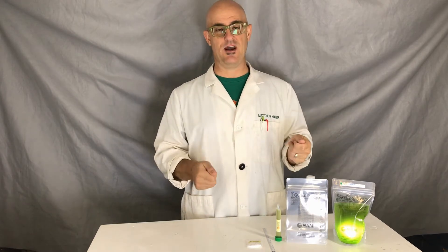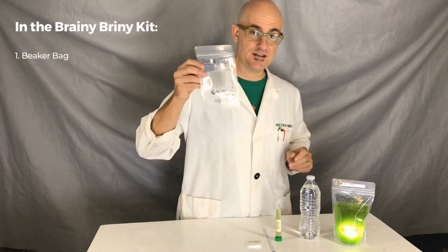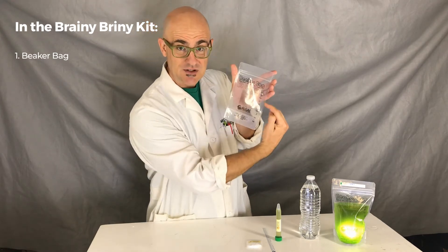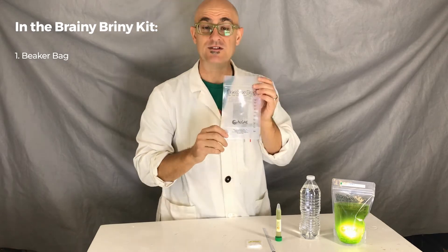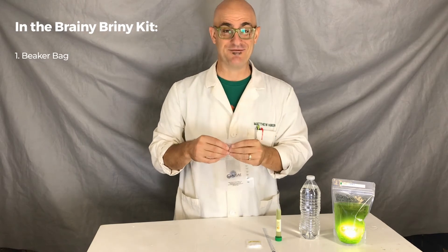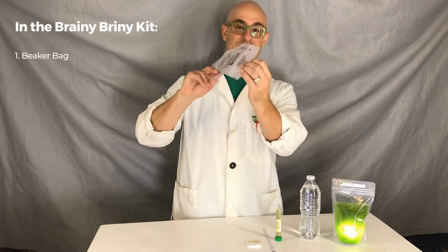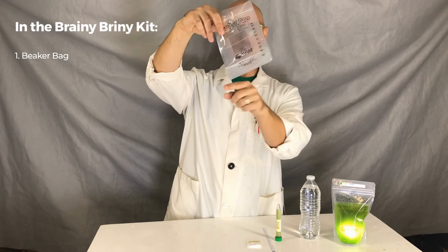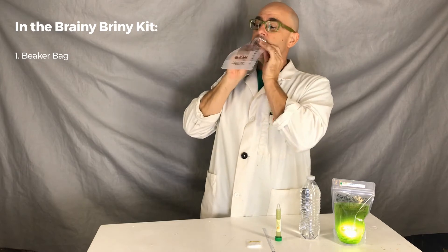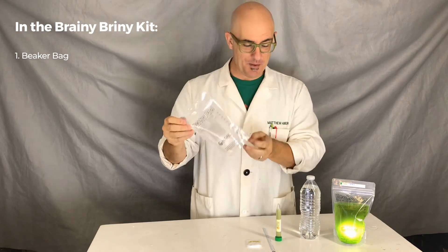You probably just got your kit and you're looking at it going, how do I do this? So let's talk about the things that are in the kit. The first thing you're going to notice is the Briny Briny Beaker Bag — just a nice poly bag. It's got graduations on the side so you can measure volume, and it's got a one millimeter grid so that when you grow your brine shrimp you can measure how big they are. The first thing you want to do is inflate it. If you try to open it up, the bottom part — which is called gusseted — doesn't open up the right way, so you've got to inflate it. See how it popped open in the bottom? Now this beaker bag is open and ready for business.